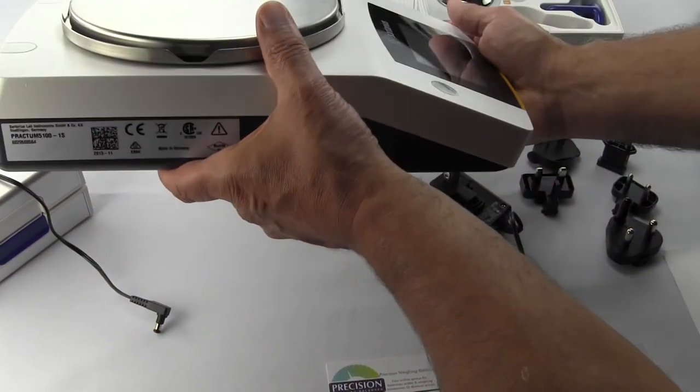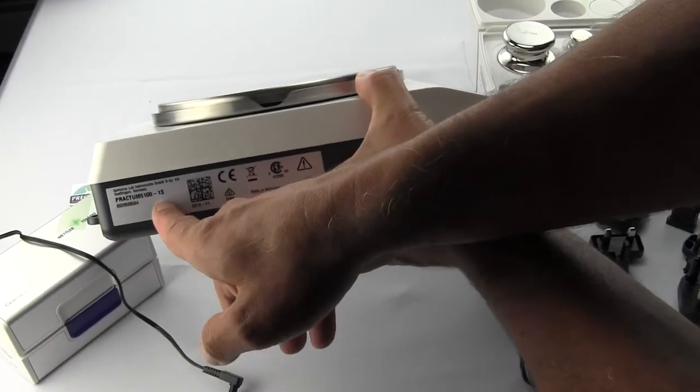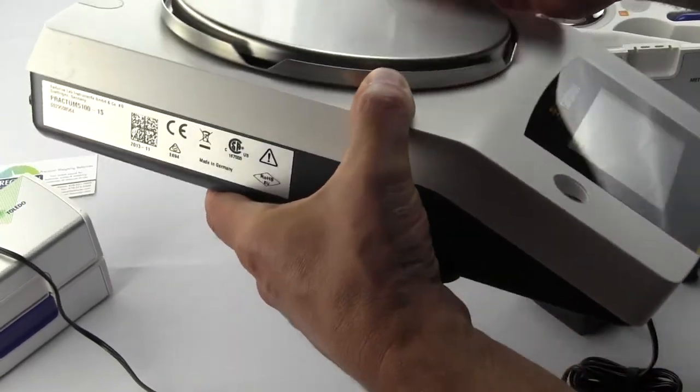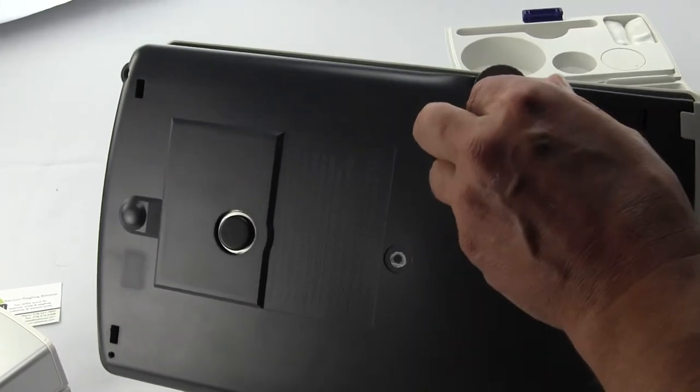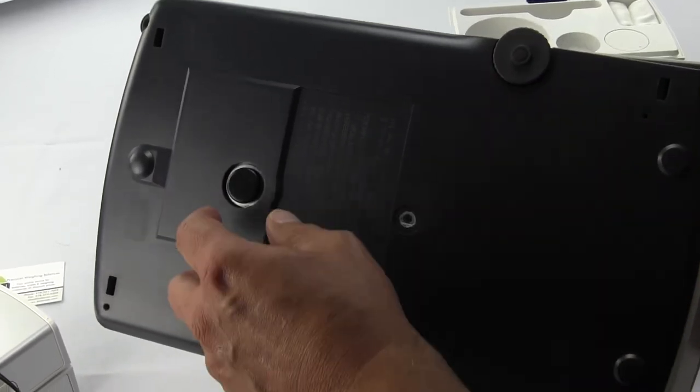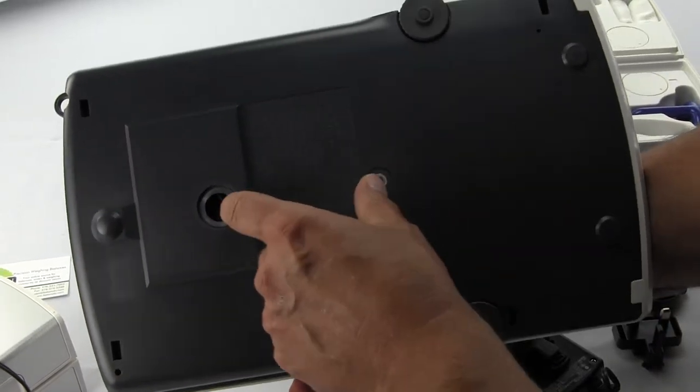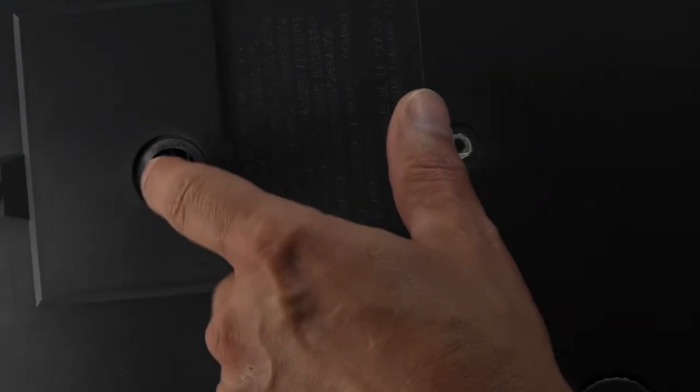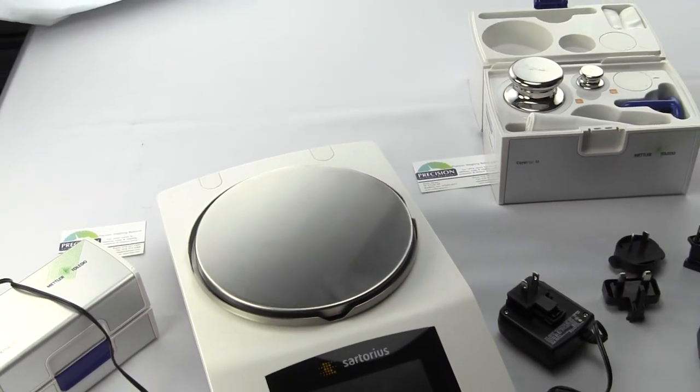On the side you can see Sartorius denotes the model number and serial number. On the bottom of the balance we have two adjustable feet for leveling. This port here has a little hanger that is used for specific gravity.